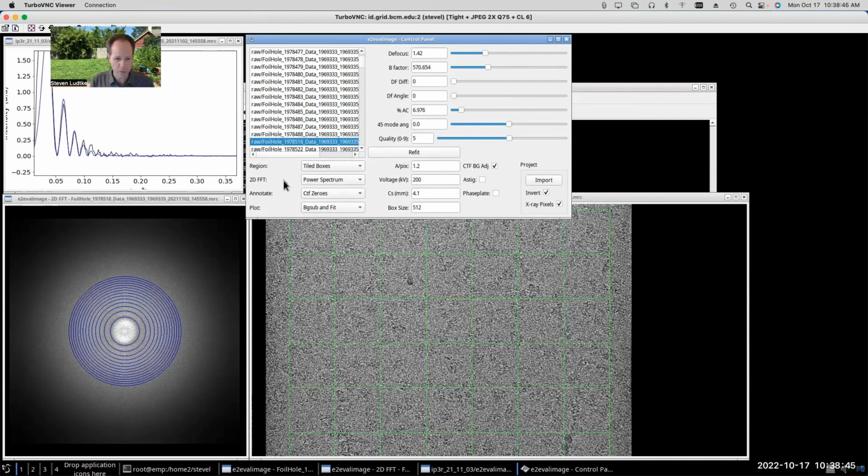It basically scatters its way through the detector, and it doesn't just produce one flash of light. Typically, it'll produce a bunch of flashes of light over a region on the detector. So every flash isn't just in the middle of one pixel. It spreads a little bit to neighboring pixels, and that smears things out. Detectors try to correct for that somewhat, but you can't correct for it perfectly. So that causes another resolution limiting factor.